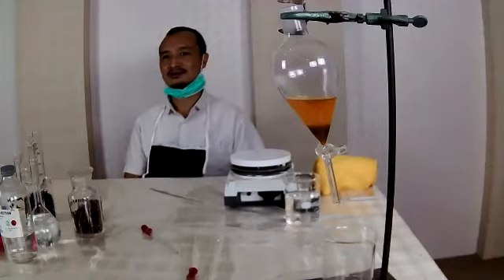Okay, thank you very much, Mbak Mentari, for sharing. And we will go to the next question. So many questions now in the chat room. The next question is from Mr. Adam De Beer. If the object being concerned with the traditional methods has been previously preserved with synthetic products, does the traditional method interact chemically in any way with the synthetic?